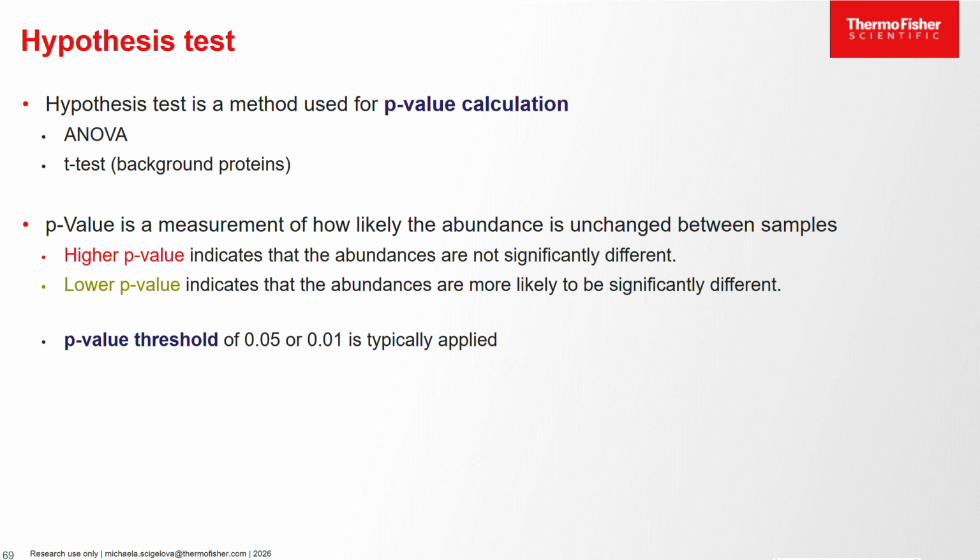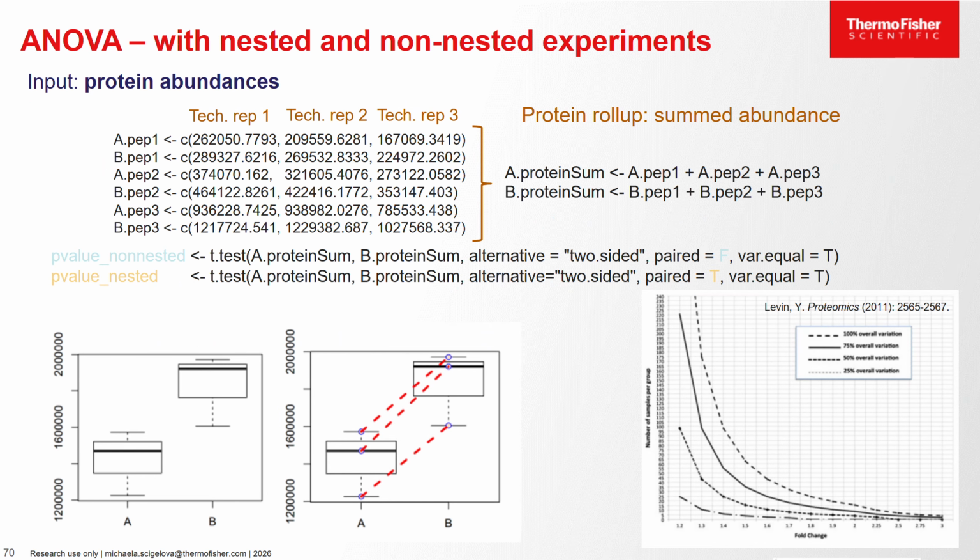Hypothesis test is a way of obtaining p-values. P-values should tell you what is the significance of the change in ratio in your samples. And it always is set up that way that the lower p-values are the ones you are interested in, while the higher p-values are the ones confirming no significant difference. What cutoff thresholds you set is your particular choice. Most of the people decide to use cutoff 0.05, but as always with these parameters, it is your choice which you have to justify.